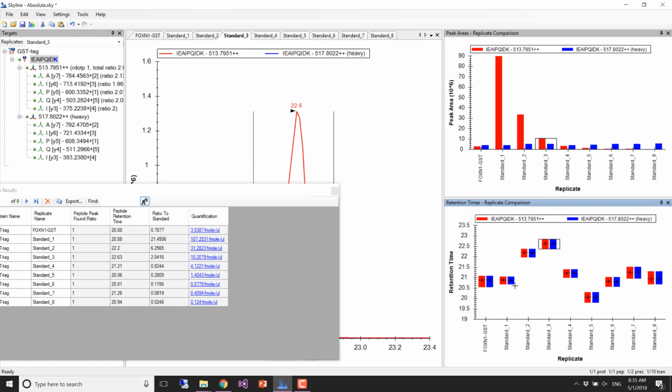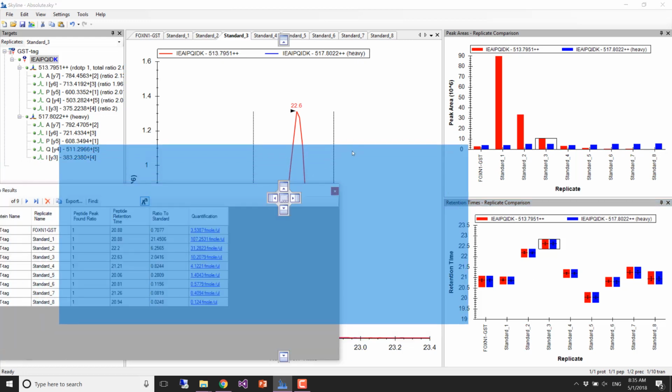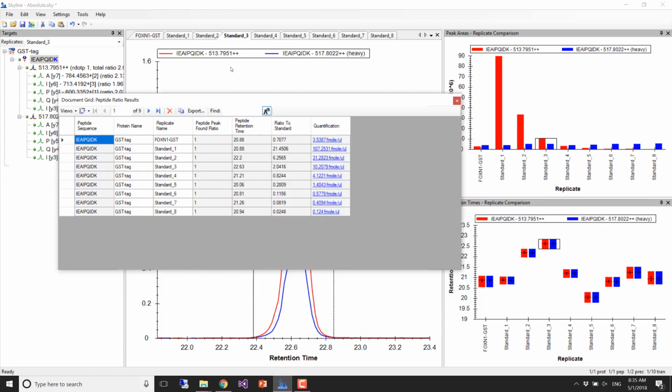Yeah, so I don't know why, but it doesn't really look like he had great control of his retention time, but I don't know how. It's kind of weird that that's the acquired time order. I'm a little suspicious of that because it's sort of the reverse of the way a calibration curve would normally be acquired, right? Most concentrated one first. I don't know. Yeah, I had never noticed that before.